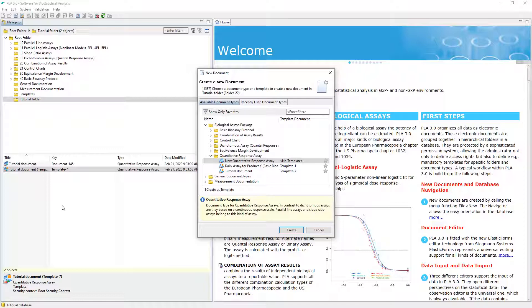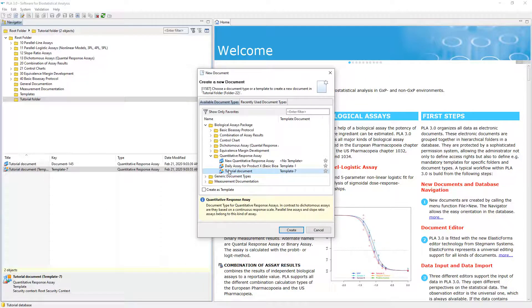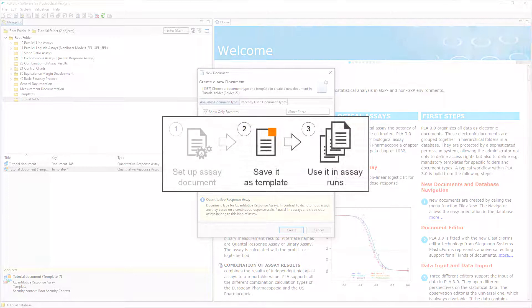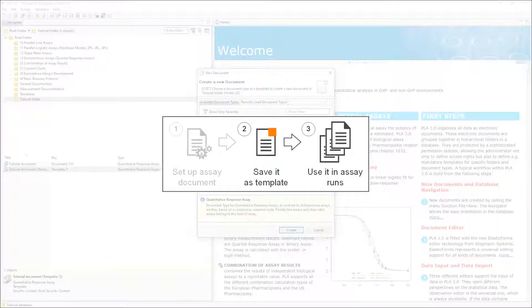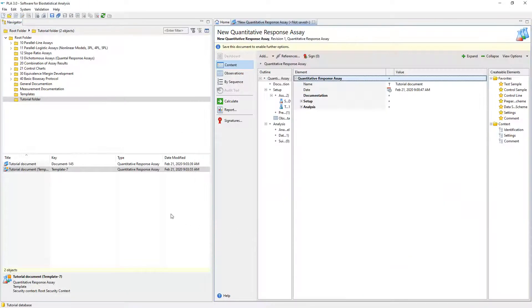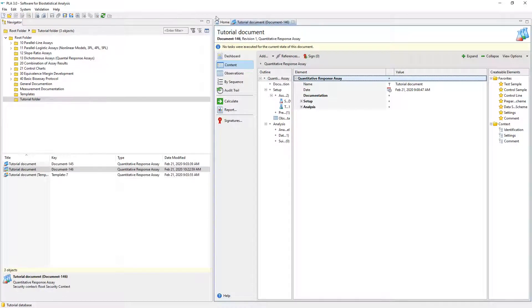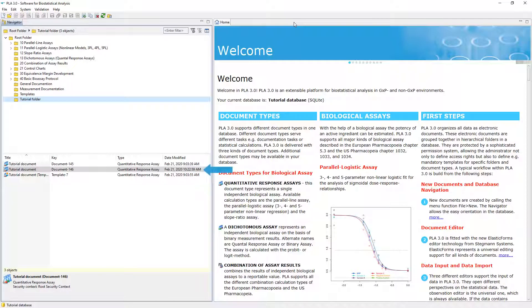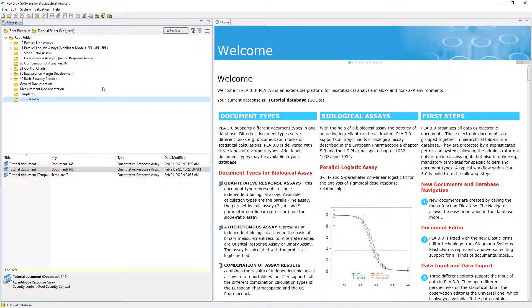If we had configured anything in the template, the document would inherit it. With an assay configuration, a template can be used for several assay runs. Simply use the template to create the assay documents you need. The document we created based on the template is now available in the navigator.